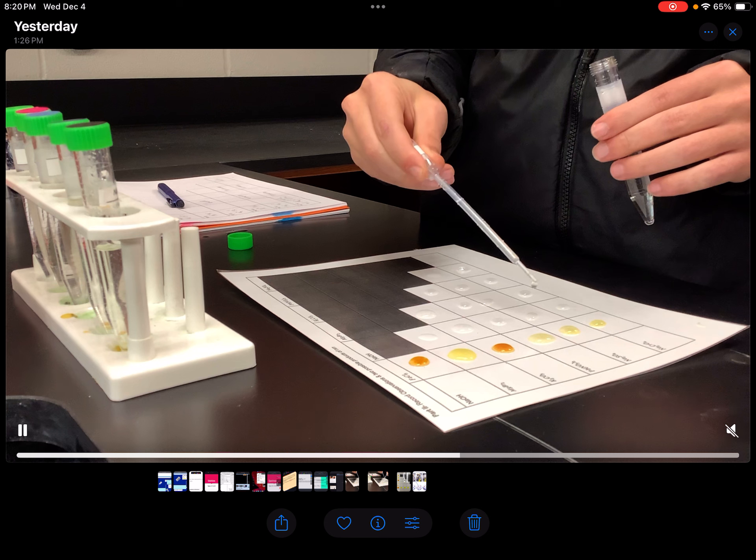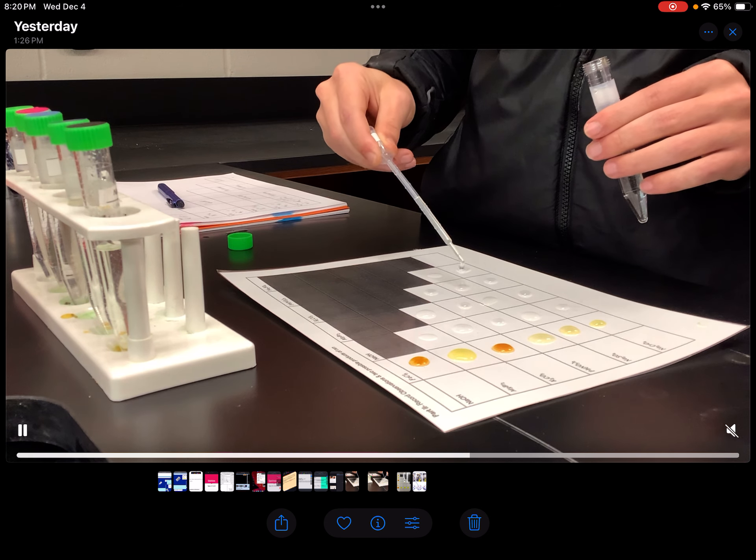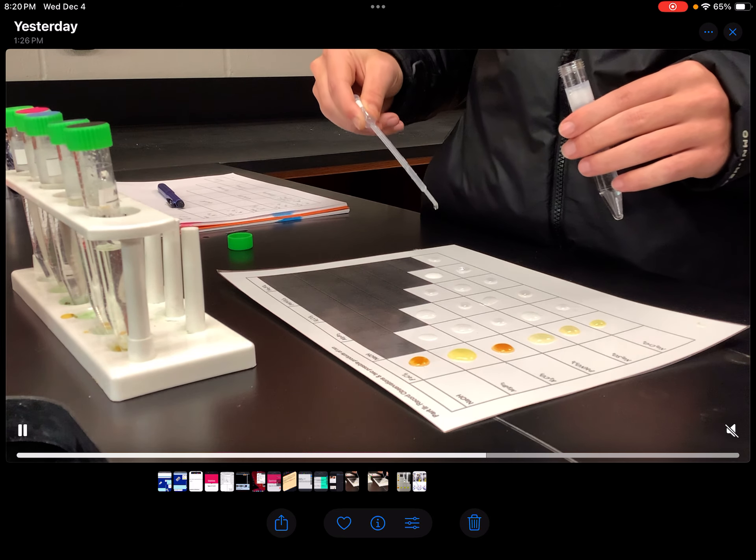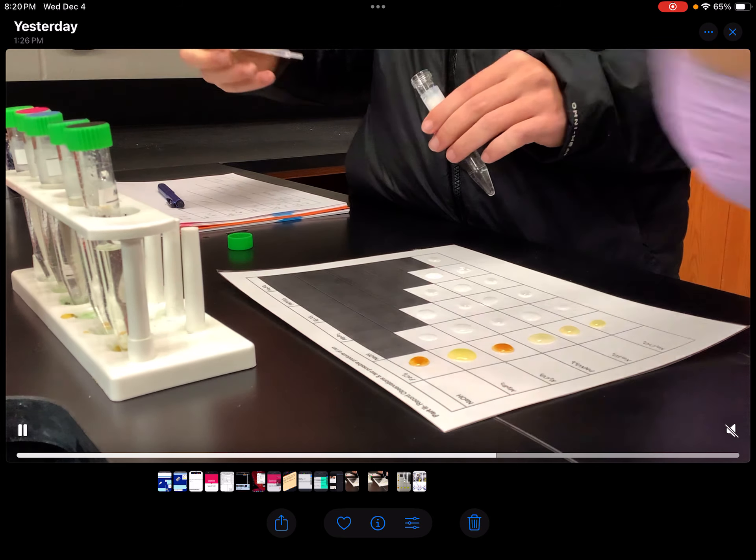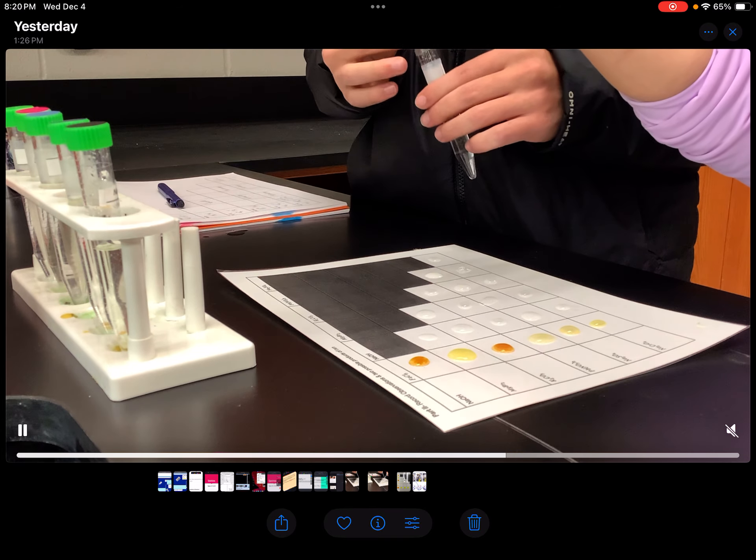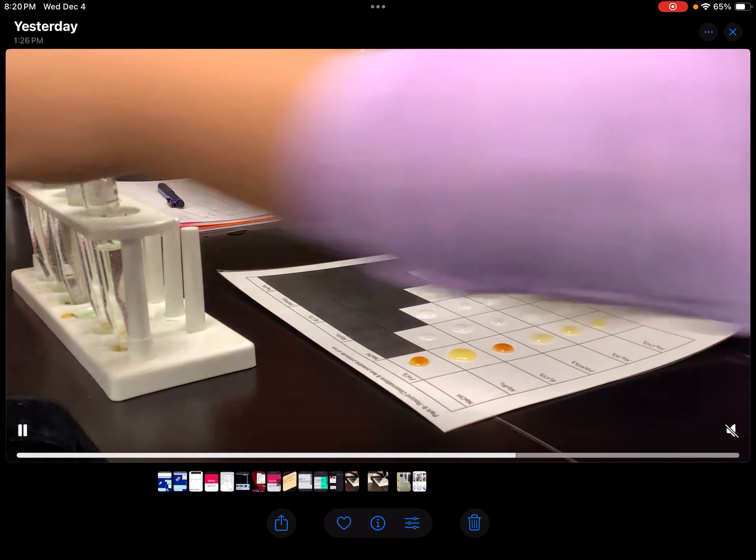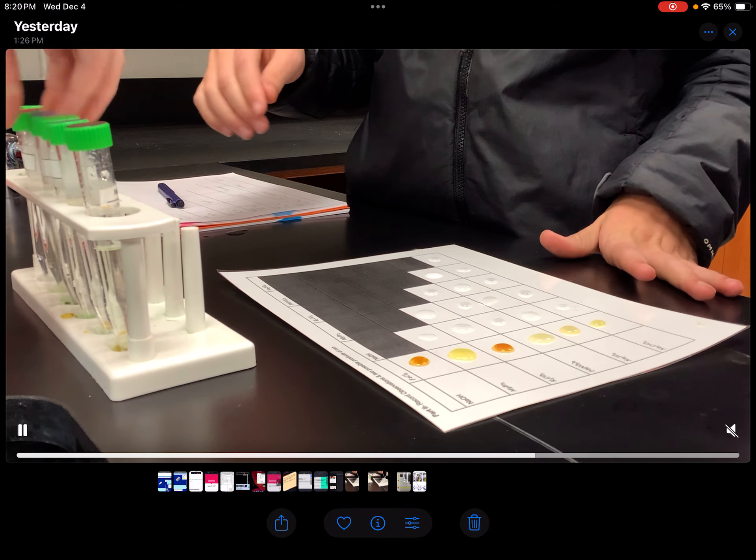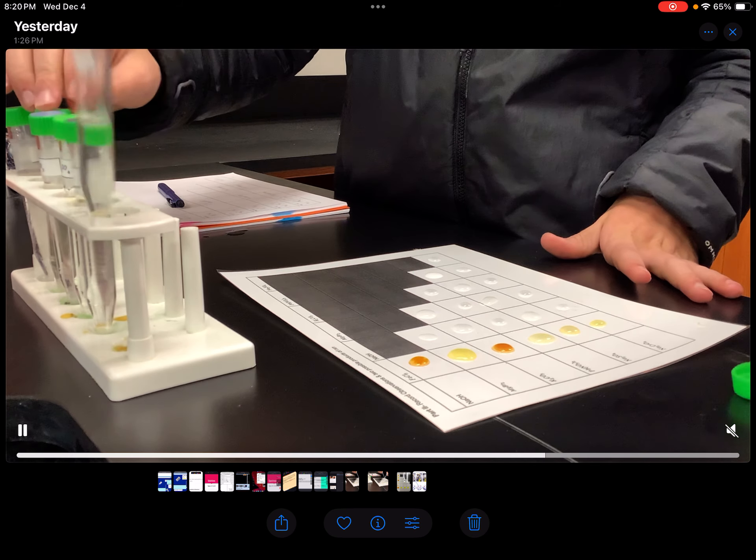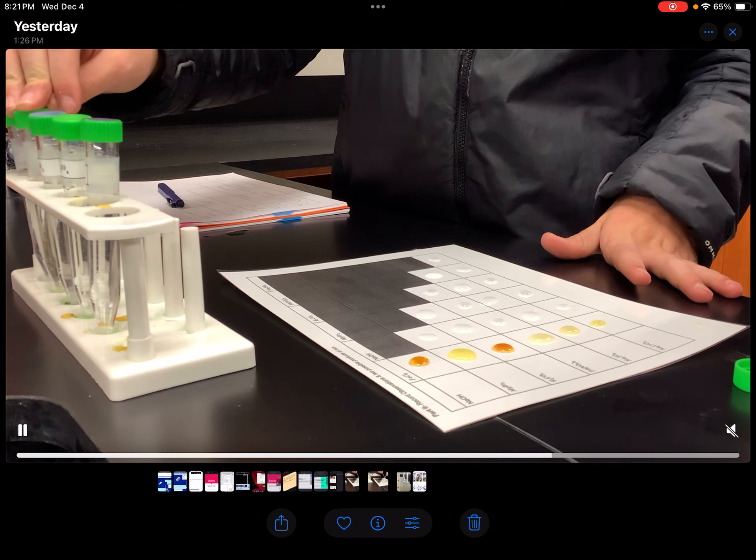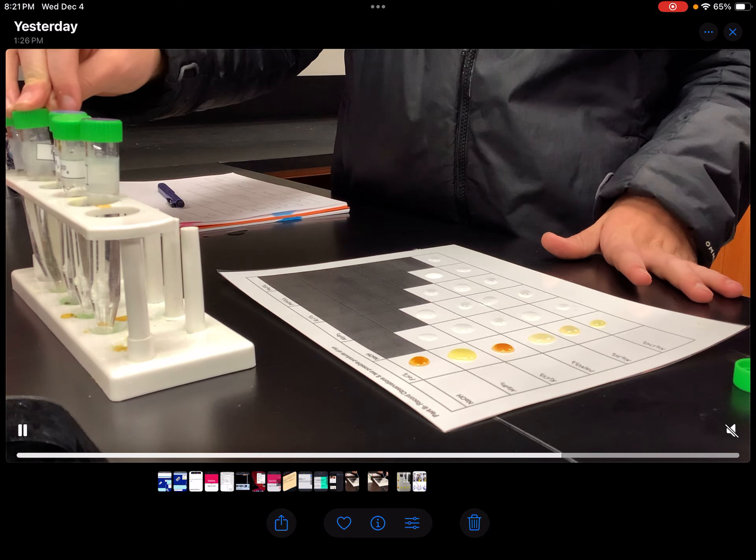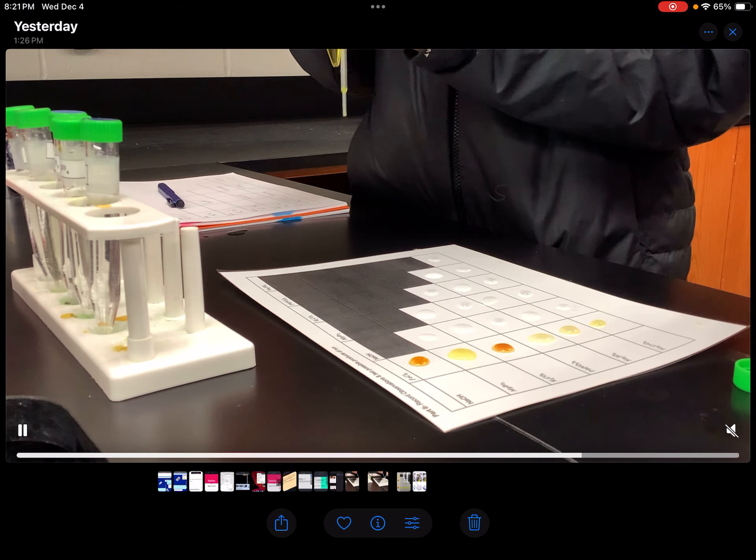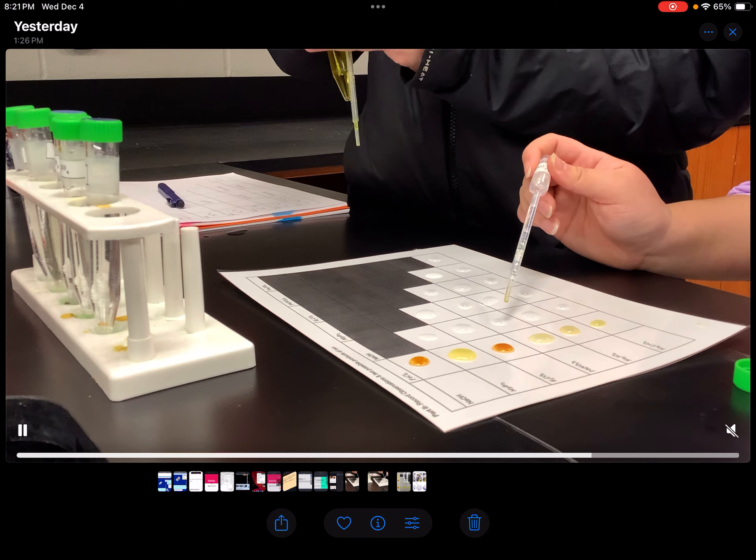Watch here as the second one is added in. See that milky white one in the second one? And then look at that last one there, you can really see that precipitant stand out well. Keep in mind, it's not just about seeing a color change, but it's actually seen like the cloudiness of that solid being created. Obviously color change helps, but you'll see in this last row here they're mixing a substance that is already tinted yellow, and so obviously that's going to make them all look yellow. So we're looking for the one where you see that precipitant stand out.